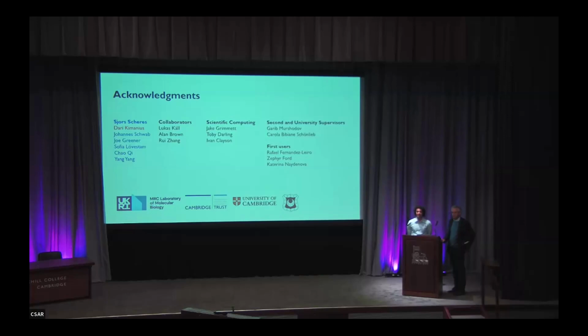Thank you. It was a really interesting talk. Can I ask, how does it scale with the size of the protein? You showed this really big protein complex, 1.2 million atoms, and that took a few hours. Presumably if it's a much smaller protein, it would take a lot less time? Yes. So it scales linearly. We tried very hard to make sure it scales linearly instead of cubically or so on. Basically, we treat each neighborhood of atoms independently, so you can parallelize over those and then slowly pull the information in. But it still needs to process all the atoms, so it scales linearly.